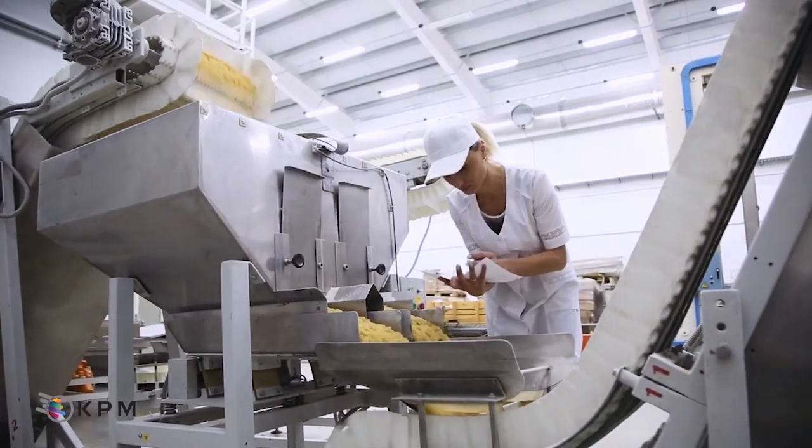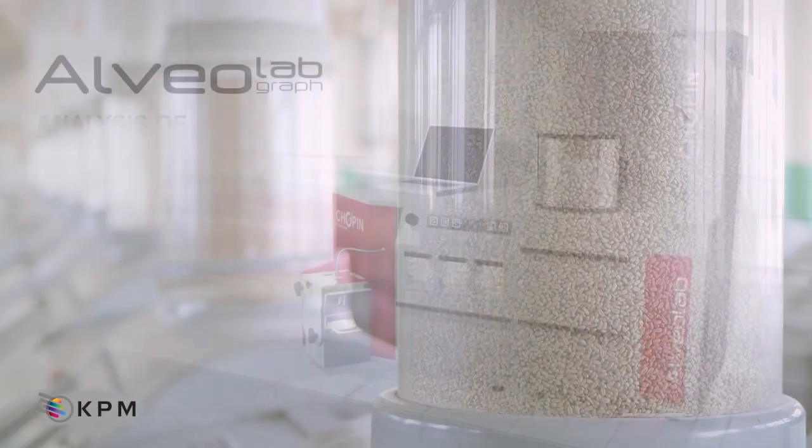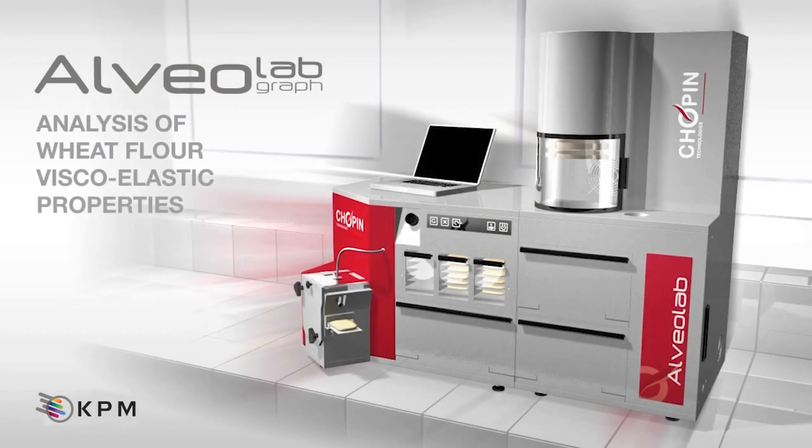This includes solutions to help bakers and millers complete their quality control programs. Wheat breeding, grain storage, milling, and baking industries use the Alveograph on a daily basis to measure the rheological properties of wheat flours.